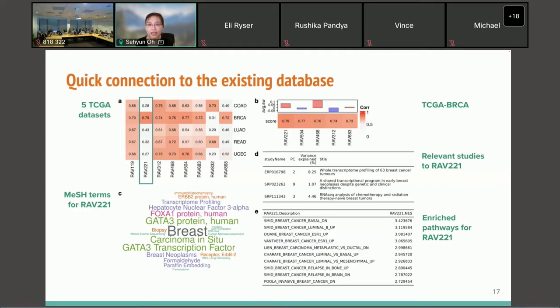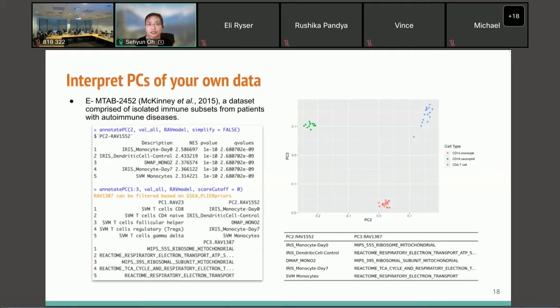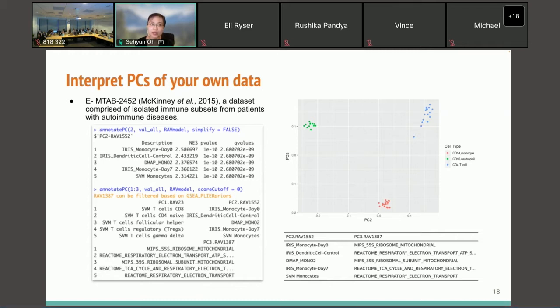The word cloud shows 'breast' as one of the most representative terms. The three relevant studies are all on breast cancer, and the top enriched pathways are all breast cancer-associated. I'll reproduce this figure in the live demo. The other use case is general interpretation of PCA results. For this example I use the immune subset dataset E-MTAB-2452. GenomicSuperSignature extracts the enriched gene sets of the RAV showing the highest validation score for the input data's principal components.